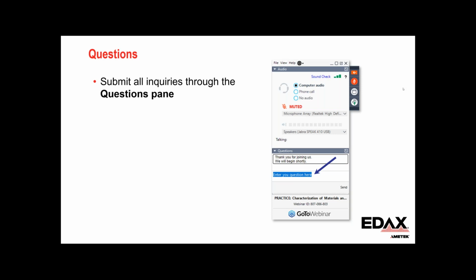There's one more question here, and Will, I'm going to start answering it, and I'll let you follow up from a refinement point of view. It's, can you comment on the speed, binning, precision trade-offs for the camera? Can you bin less for the faster cameras and get better precision at similar speeds to the slower cameras?